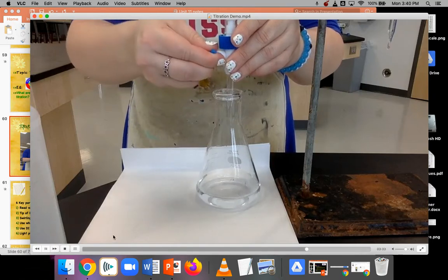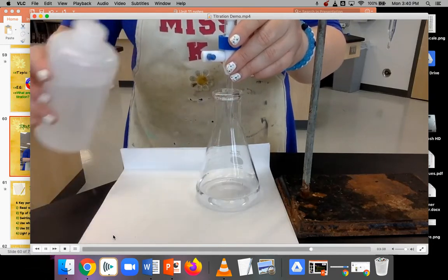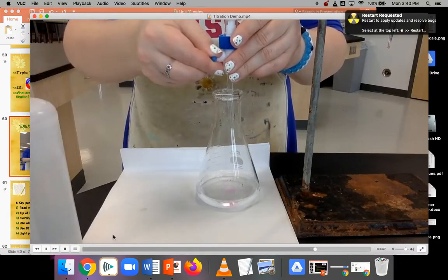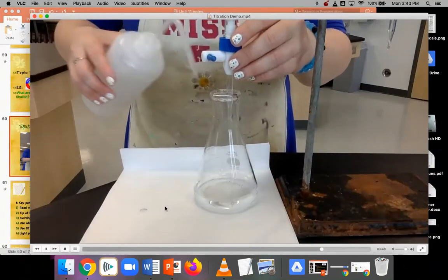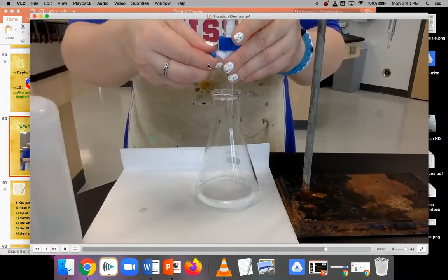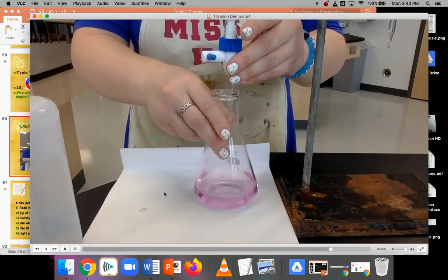Okay, keep going here. So notice I'm getting close, close, close. Look at how long that pink is staying when I swirl. I rinse the tip. I'm going slow. I'm barely opening the stopper. Oh, man. So close, so close. But it's still clear. So I rinse a little and then notice I'm opening, just look how barely I'm moving it. So I just get a little bit to kind of hang off the end.